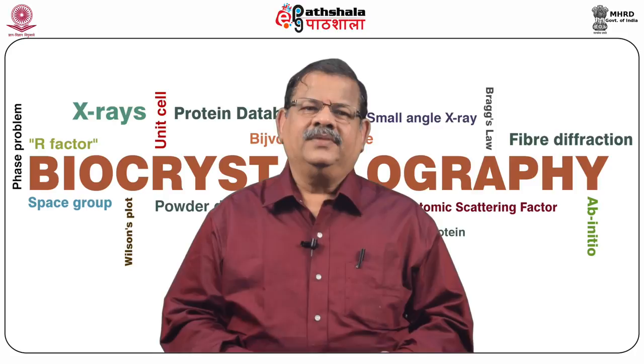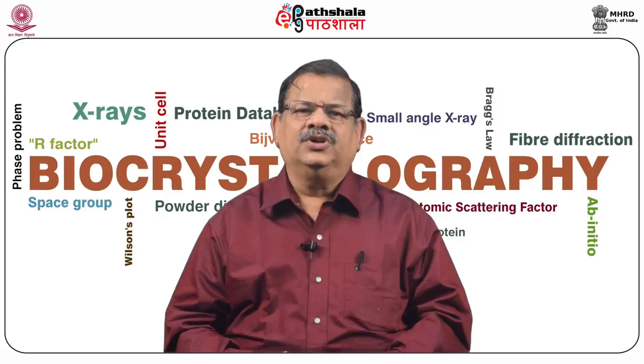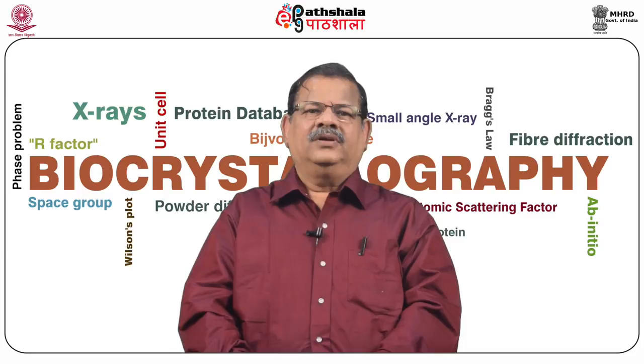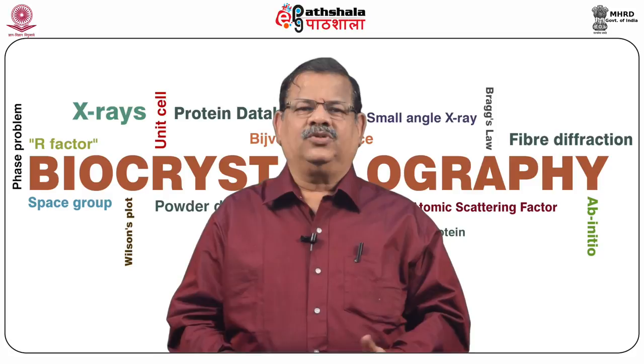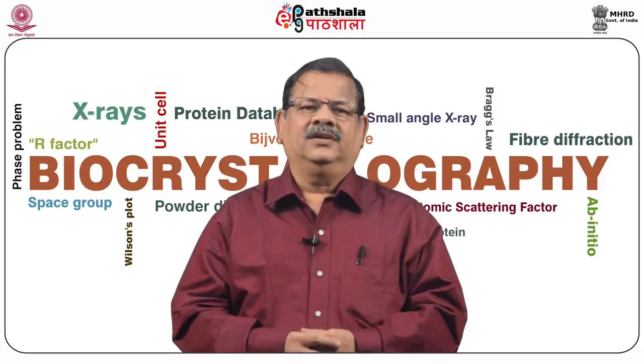Today, I am going to talk to you and explain in this module the determination of the three-dimensional structure of small molecules using single crystal X-ray diffraction. As you know, we have more than 8 lakh molecules deposited so far in the database known as the Cambridge Structural Database. So we are going to learn how the molecular structures can be determined using single crystal X-ray diffraction, which forms a part of the paper Biocrystallography.